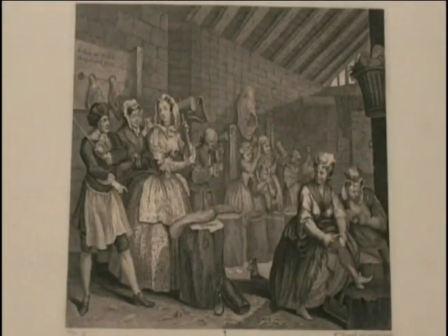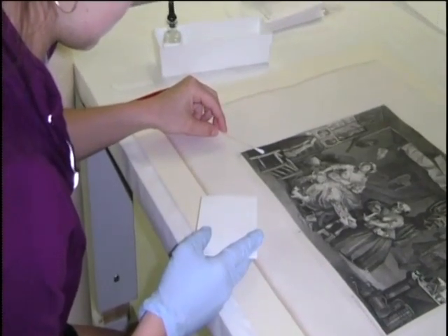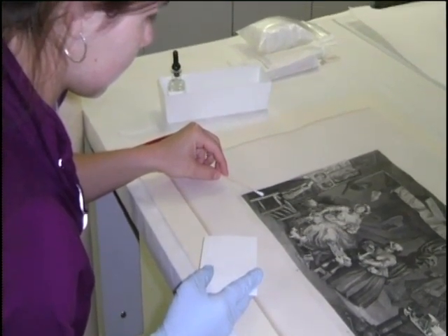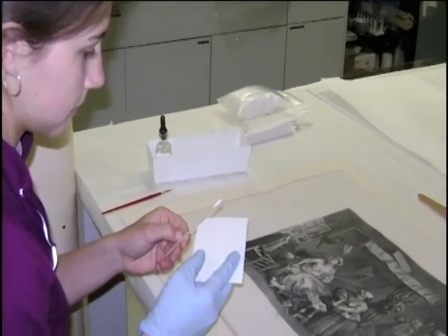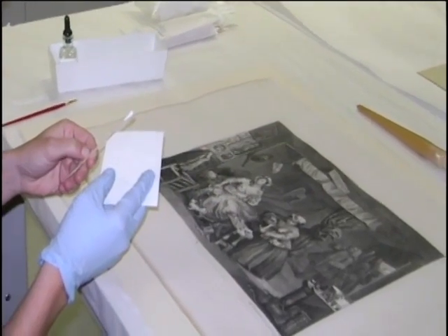Solubility testing is a crucial secondary step of the treatment process. We cannot assume that the ink is oil-based just because it is black. Printer ink, pastels, and watercolors are just a few of the media that can dissolve in water. We tested the solubility of the ink using two wet methods and a dry method. When we rolled over the surface of the print with a dry cotton swab, a small amount of the black ink came off mechanically.